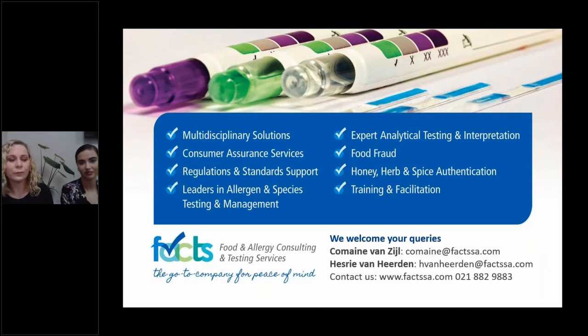Is the rapid kit enough for positive release? We mentioned the difference between product testing and cleaning efficacy. In this case, can I let it go just based on that rapid kit? At this stage, we recommend that the rapid kits, especially those suitable for product testing and ingredient testing, are used for screening purposes, because there are limitations with regards to protein extraction and matrix effects that are overcome when you do actual laboratory testing. So at this stage, for positive release, we would err on the side of caution and say rather go with laboratory testing, and then slowly but surely incorporate rapid testing once you have supporting evidence that they are going to be effective.